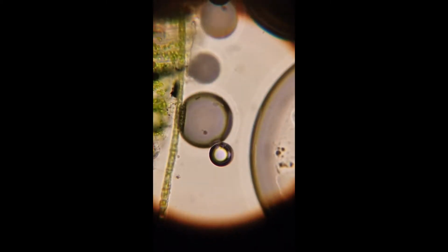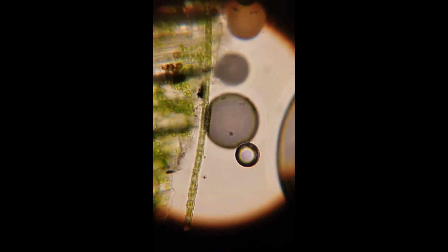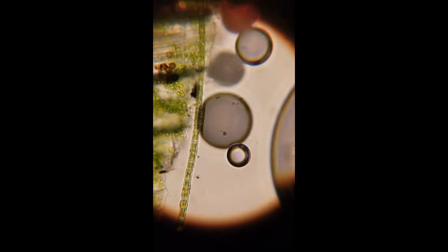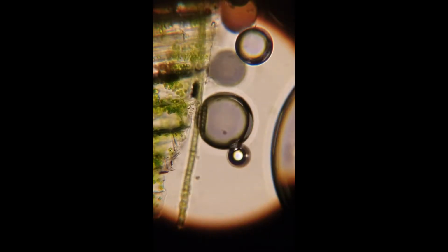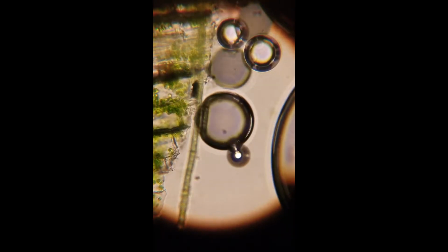And what I noticed was that with one bubble, it overlapped this filament of algae that you see. And this bubble is acting like a lens, like a small magnifying glass, or rather doing the opposite. You can actually see the algae filament being refracted through this bubble.